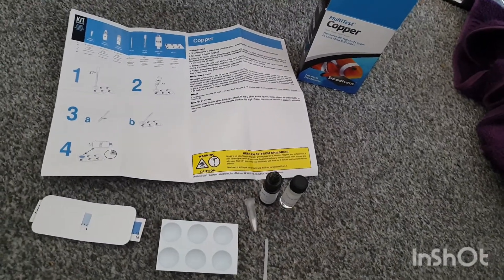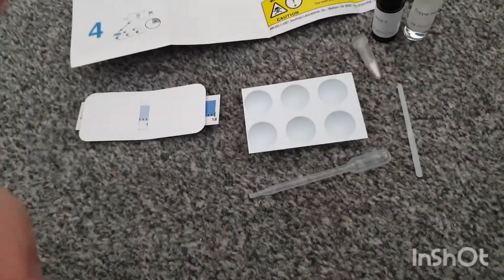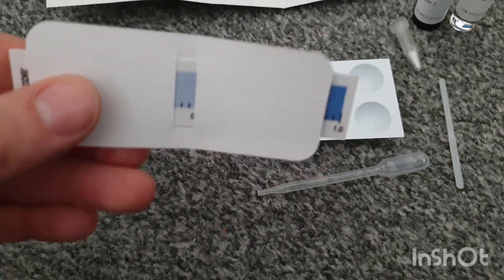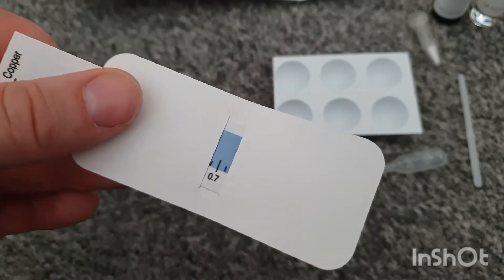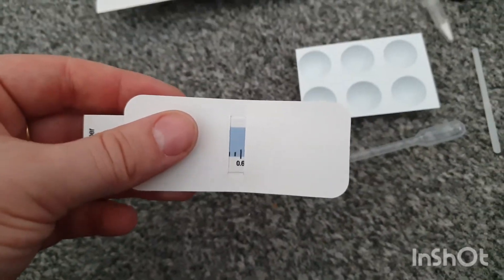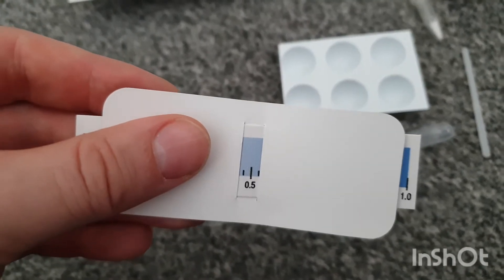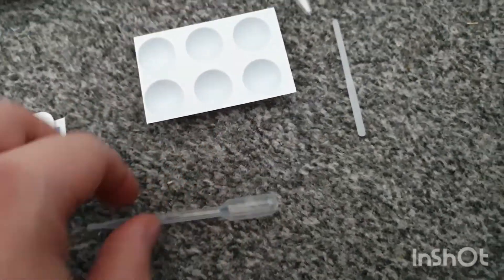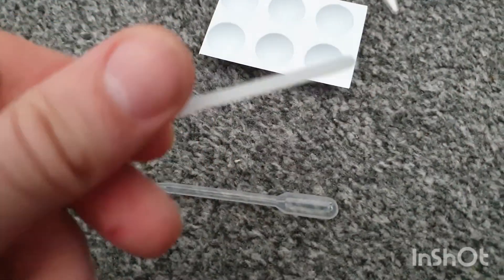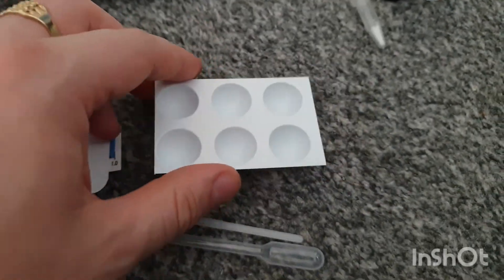So in the box this is what we get. We've got our instructions and how to dose, which I'll go through and explain. Basically we get our chart and colour comparison, which is how we measure the amount of copper in the water so we can check that we're at therapeutic level. We're going to test today and see. You get your pipette, your little stirring stick, and your little dish which is what we do the test in.